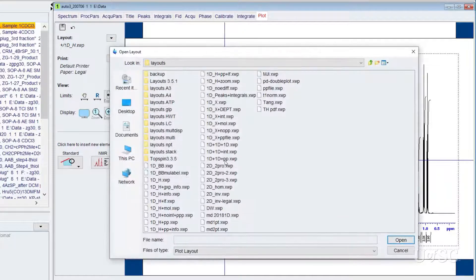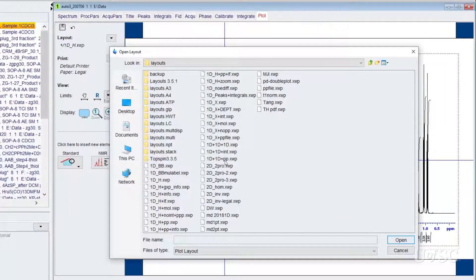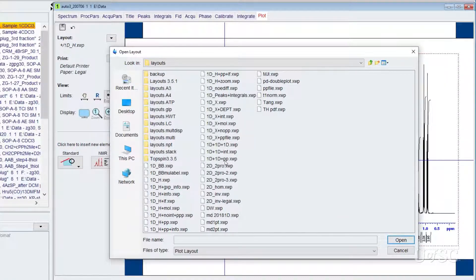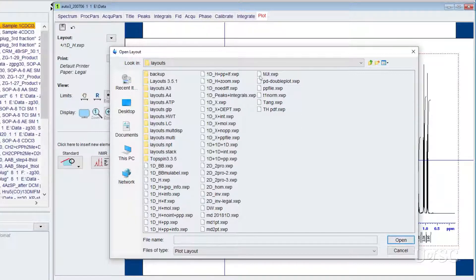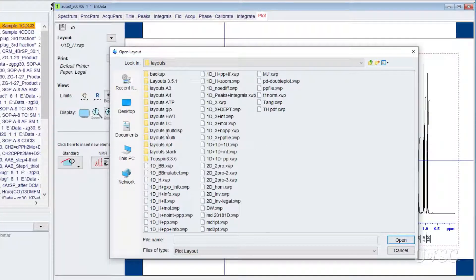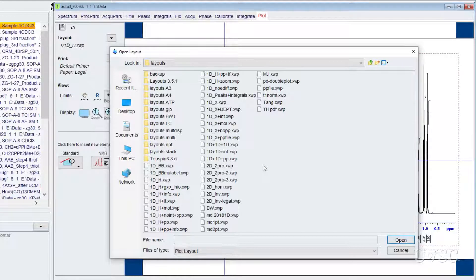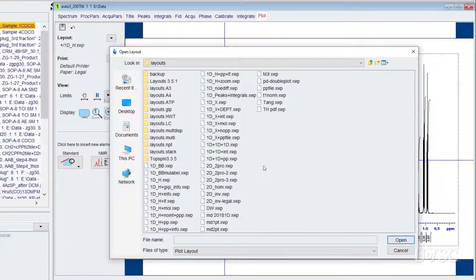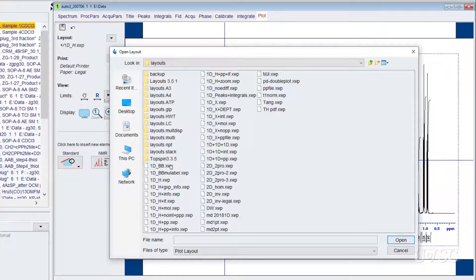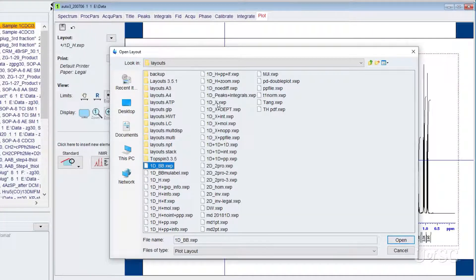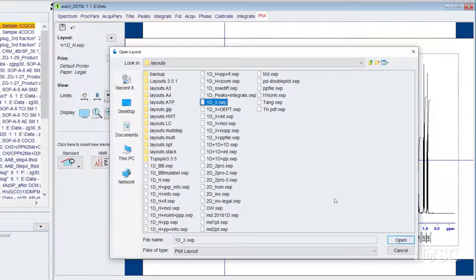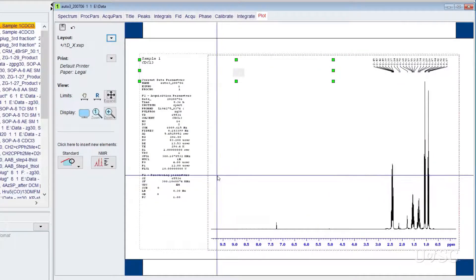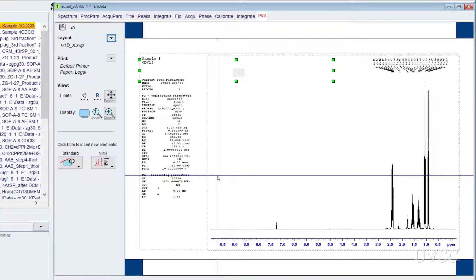The list of layouts includes many that are included with the topspin distribution. The more important ones are described in our topspin manual. For plots that you want to include the peak labels but not the integrals, you would choose either the 1d_bb or the 1d_x layout. These are the default for experiments like carbon and phosphorus. As you can see the page layout changes to reflect the new choice.